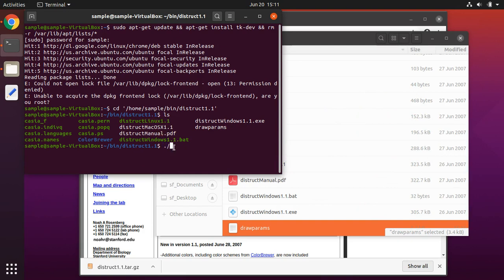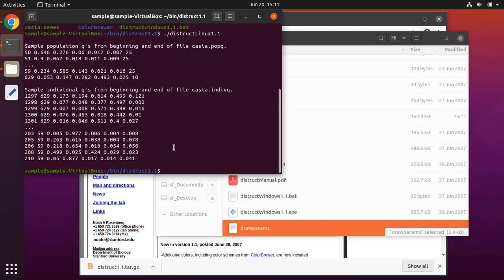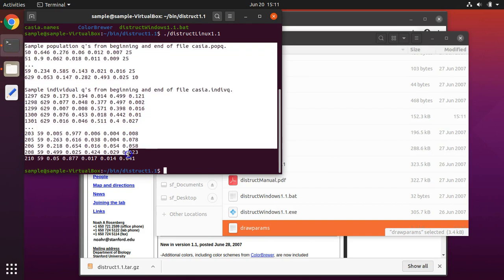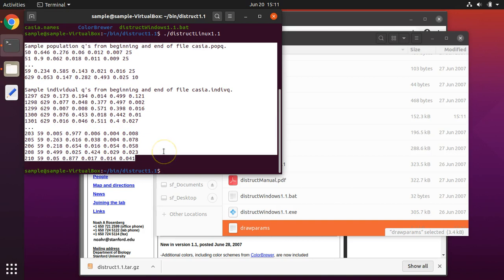And then you run this command. To run this file, you'll see some information on your screen. Right now, I just have DISTRUCT running the sample data that came with DISTRUCT.